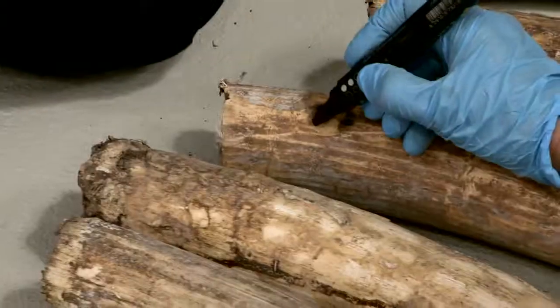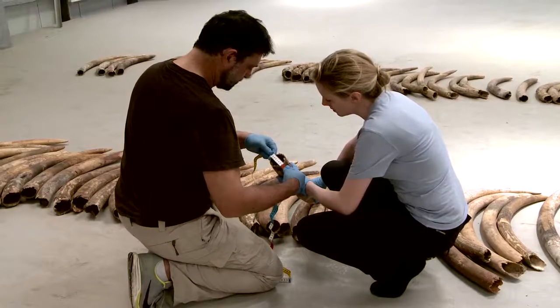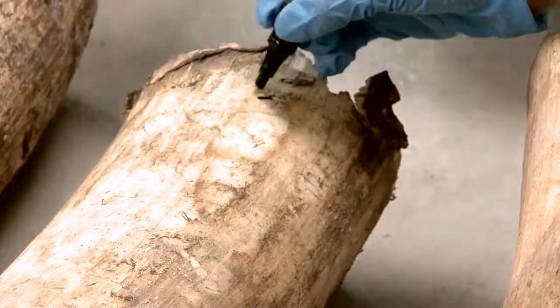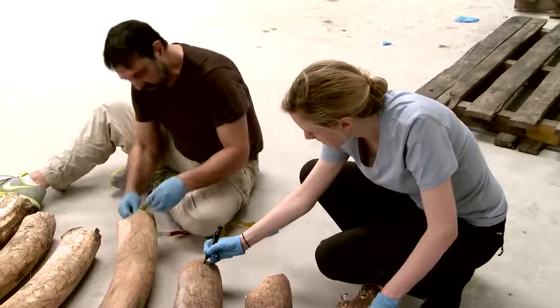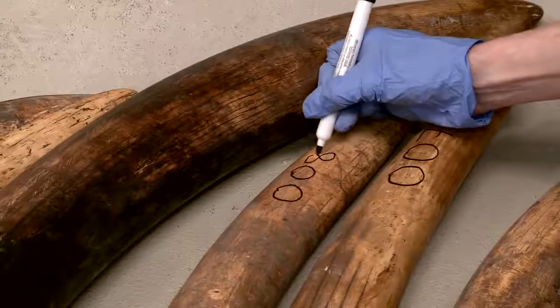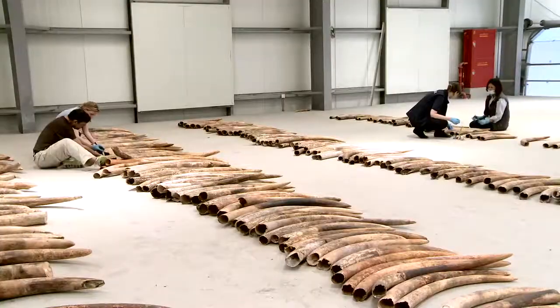Number each remaining tusk or tusk section and measure its diameter at the base. Write the tusk number and diameter measurement directly on the tusk using a permanent marker. You will need this information later. Record this information on the data sheet.